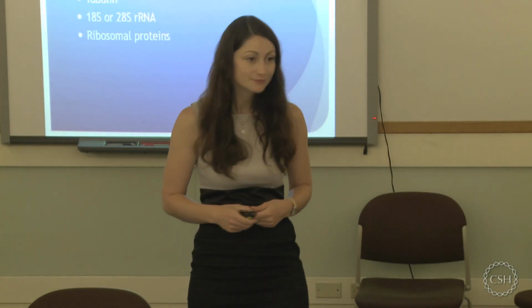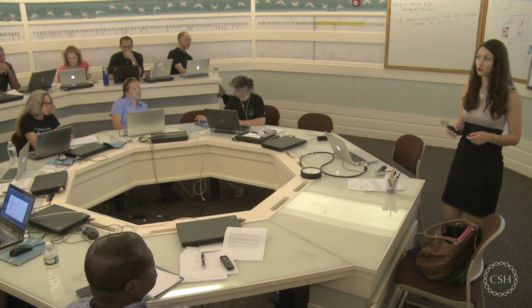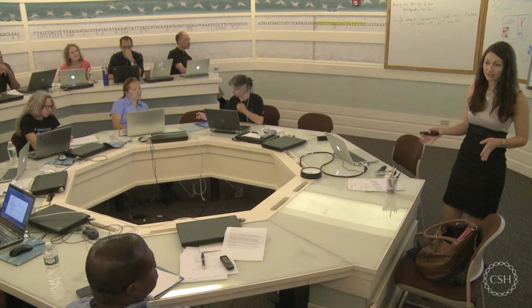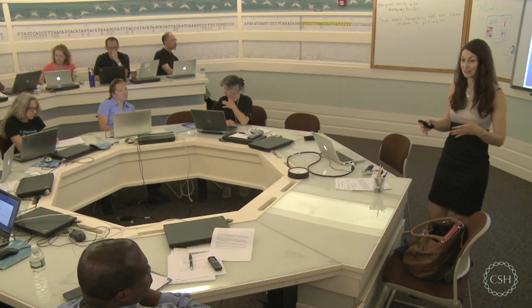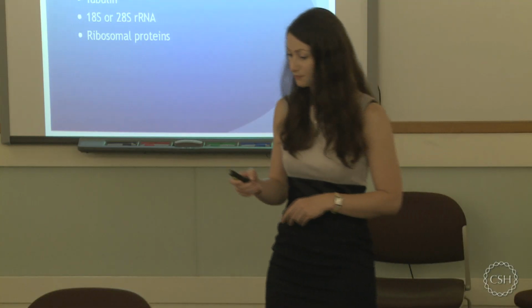Within a certain range? Like above. If we talk about the efficiencies, they should all be in the 95 to 105 range. If you have two primers which both have 95, that's perfect. Then you're comparing the same range. Although they don't amplify with 100% efficiency, they amplify with the same efficiency in both. Still, if you have two primer pairs which amplify with 80%, I still wouldn't go for it. It's just not a good qPCR result.